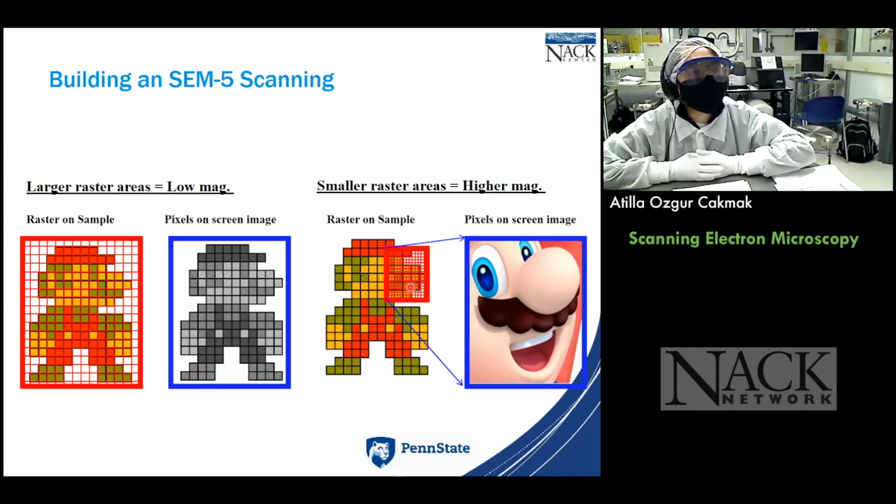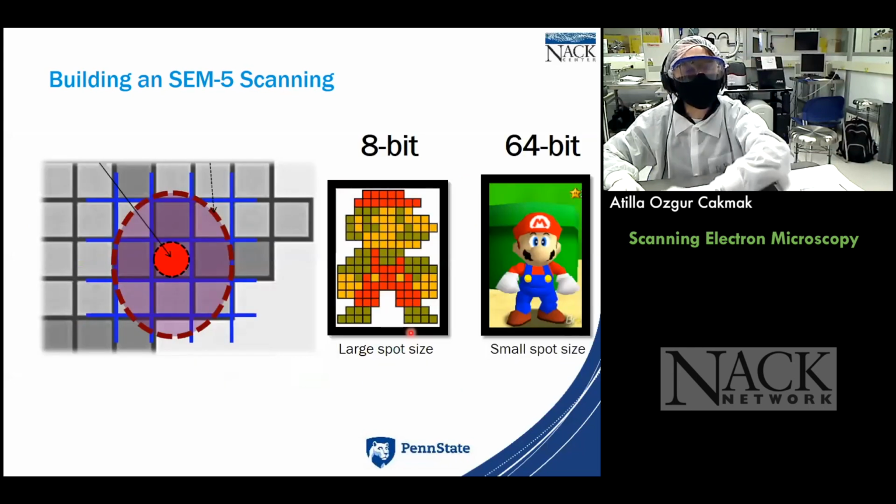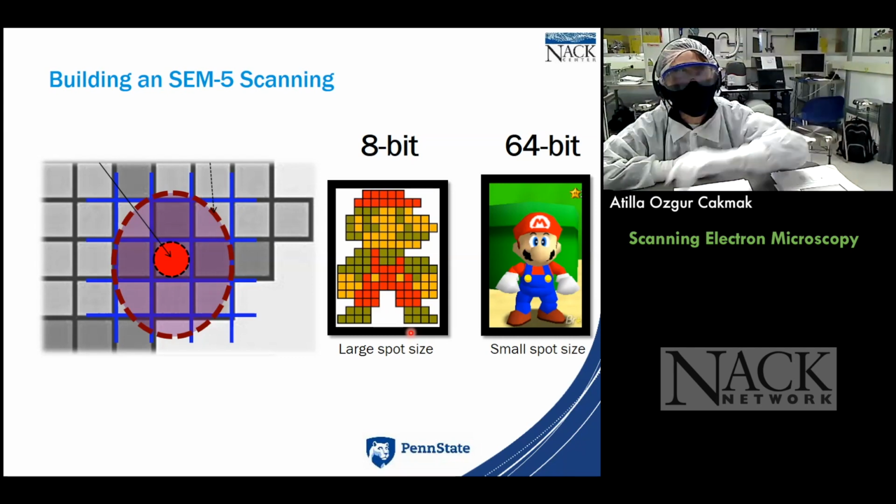Right, so another great question from Narendra: do you have to cap your sample in gold? Yes, that's what we're going to see in our samples when we do the imaging too. There's a problem called the charging effect, and we have to counteract that. I'll come to this question later on to show you.